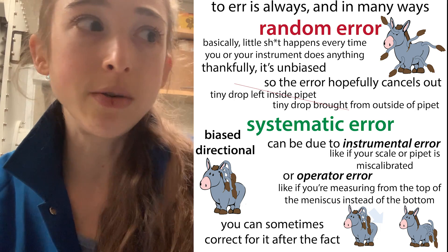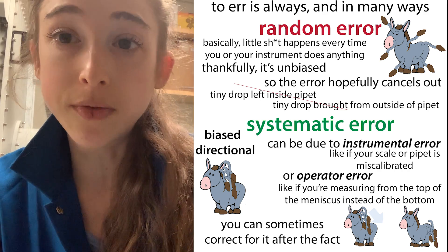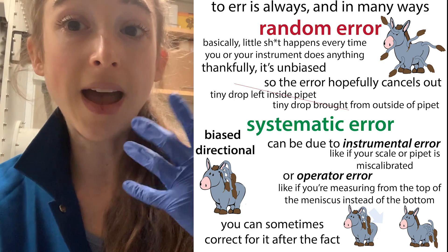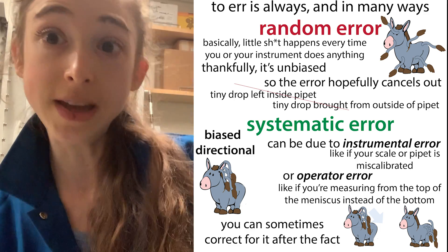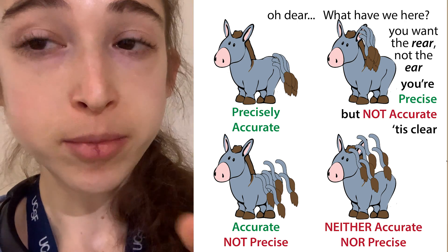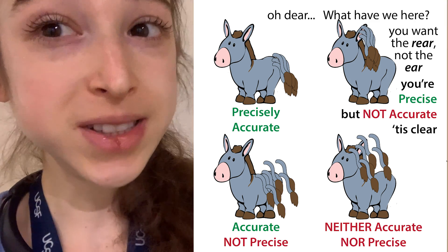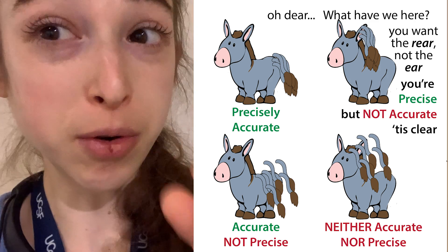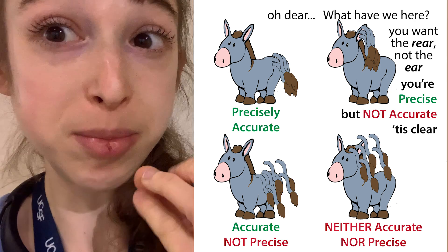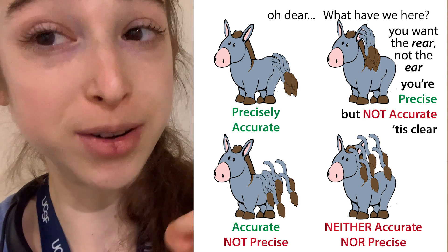For example, if you thought you were supposed to measure from the top of the meniscus, and then you realized you were supposed to be measuring from the bottom of the meniscus, all those previous measurements would have a systematic error—they'd all be higher, inflating all their values compared to the real value. Both of these types of error will affect your accuracy—how close you are to the real value. But you could still have really high precision. If you were measuring from the top of the meniscus every time, your values would all be really close together—very precise, but not accurate because they'd be shifted from where you're supposed to be.